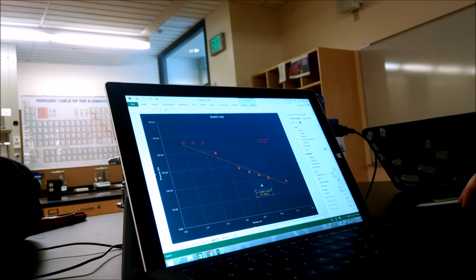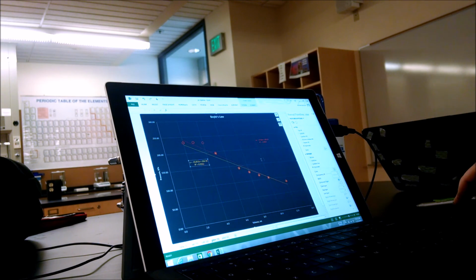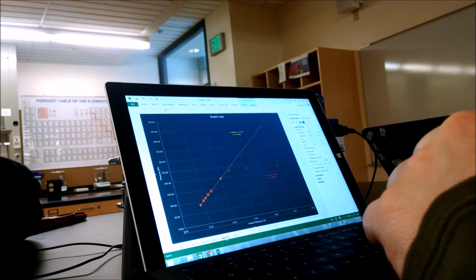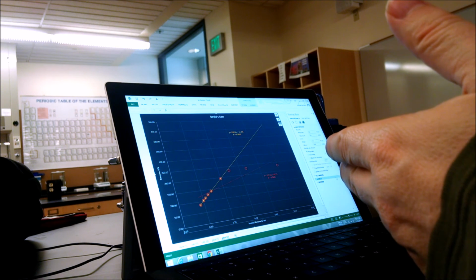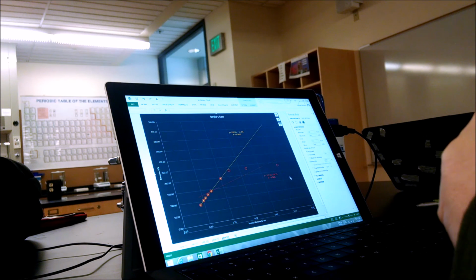I want to have this be close to the actual line. Yeah, wait. So I would put that one up there. Yeah, and up here, right? Like right there? Mm-hmm. Okay, and then what are we doing with this one, though? Yeah, throw that one on the other side. Like right there, maybe? Yeah. All right, so that's cool. It still weirds me out that line looks darker than this. Whatever. Okay, so there's that one, and then the other plot, we already have them moved, so it's pretty good, right? Yep. Looks pretty good. All right, so it all looks good.